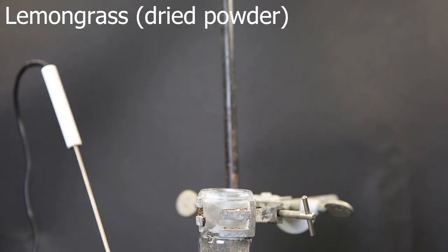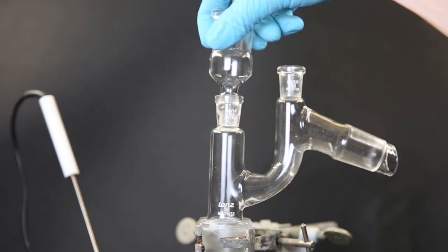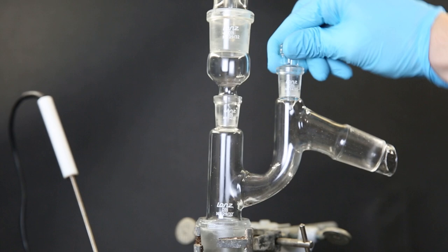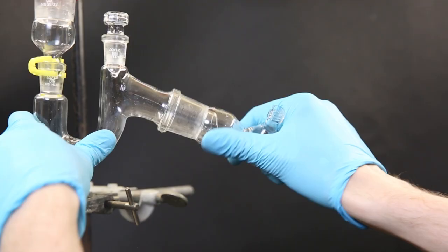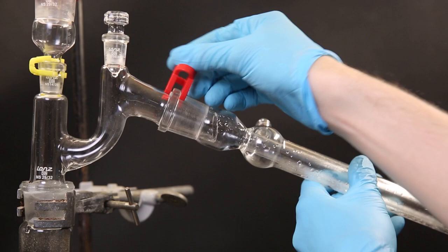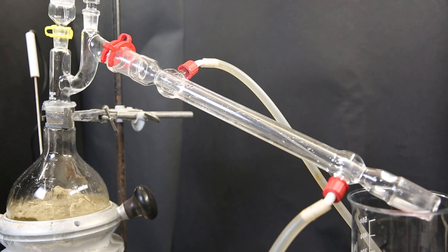I then start building a simple steam distillation setup. I add a Klysen adapter on top. On the left, I add an adapter with a dropping funnel that contains water. And on the right, I simply add a stopper. Then I attach a condenser that leads into a beaker. Now I can start the steam distillation. So to start it off, I add in water from the dropping funnel and heat the flask so that the water begins to boil.